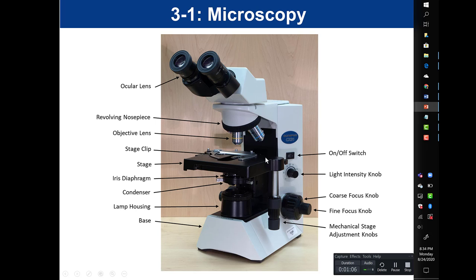This black platform is referred to as the stage, and this is where we put the slide — in the stage clips. Underneath the stage is what's called the condenser, and its job is to gather and focus the light up and into the specimen.